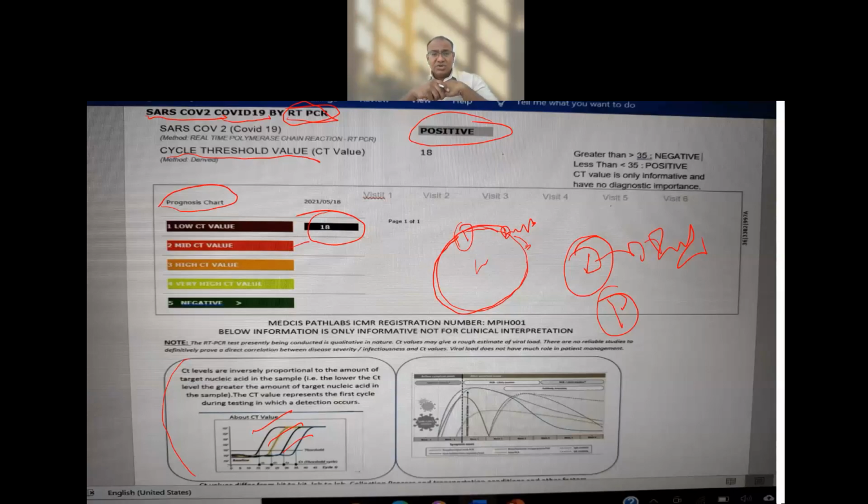We are going to learn that in a little more time. The quantitative measurement will tell me, through the fluorescent technique, the fluorescent probes or fluorescent material, because when I see the virus, it doesn't have any color.